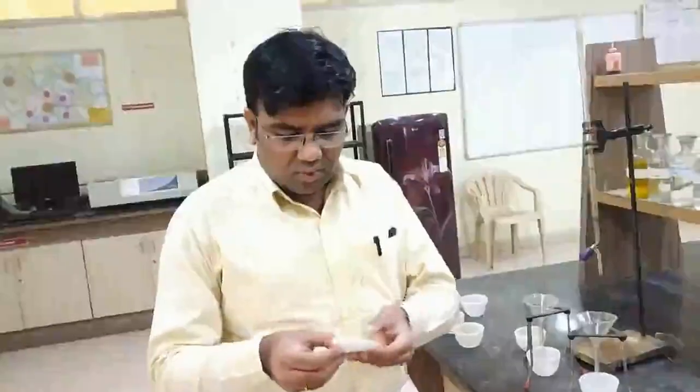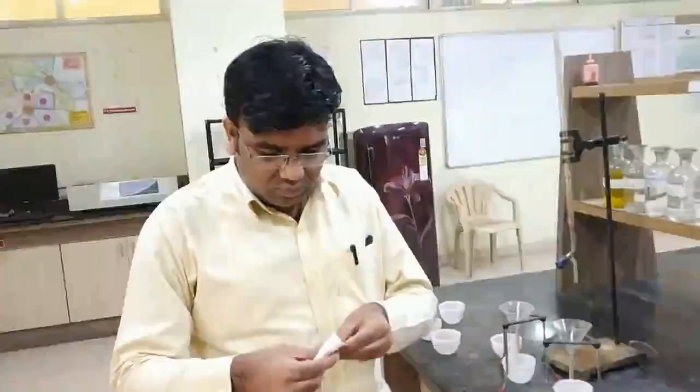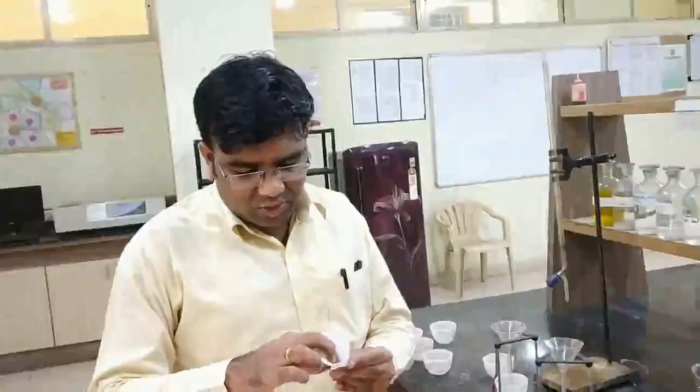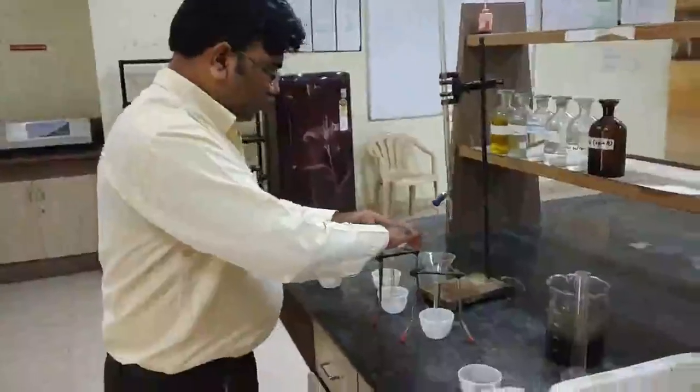After that, I will be making a quarter fold for this. I will be putting this filter paper in this particular manner in the funnel.